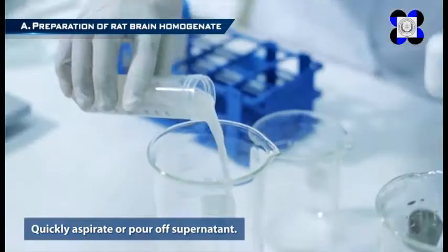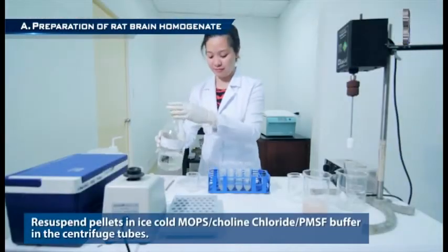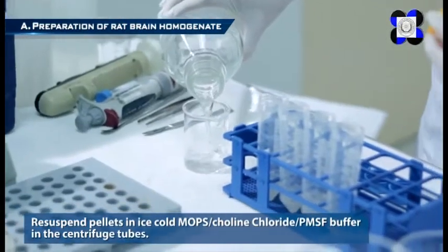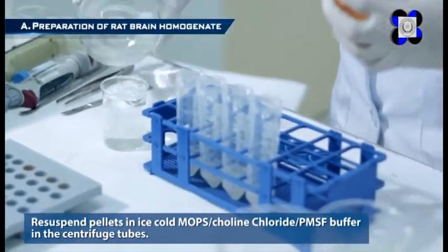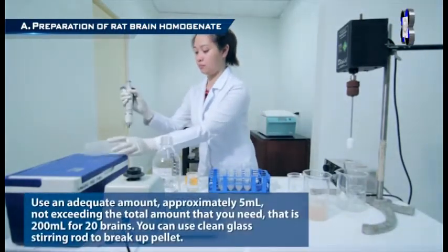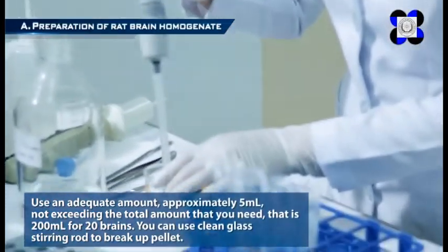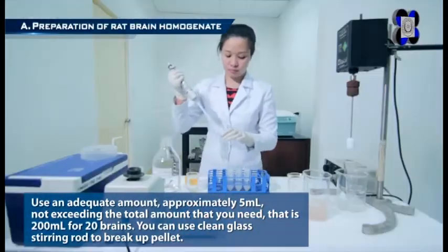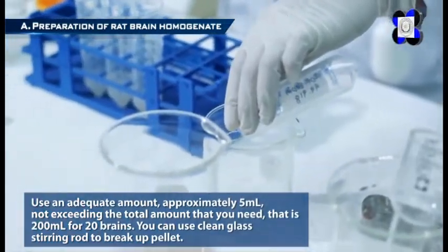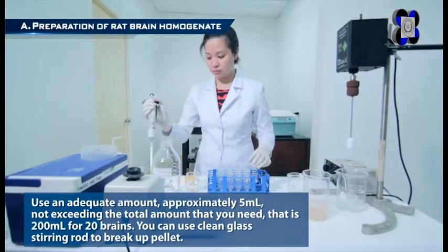Quickly aspirate or pour off the supernatant. Re-suspend pellets in ice-cold MOPS Choline Chloride PMSF Buffer in the centrifuge tubes. Use an adequate amount — approximately 5 milliliters — not exceeding the total amount needed, which is 200 milliliters for 20 cortices. You can use a clean glass stirring rod to break up the pellet.